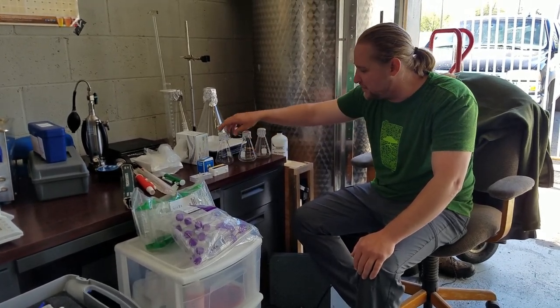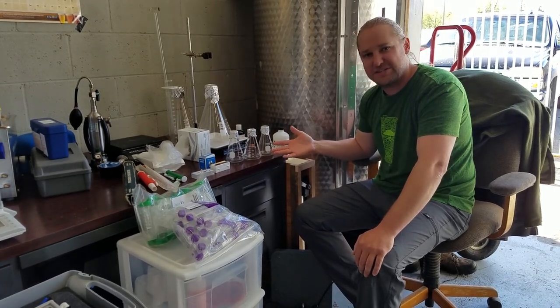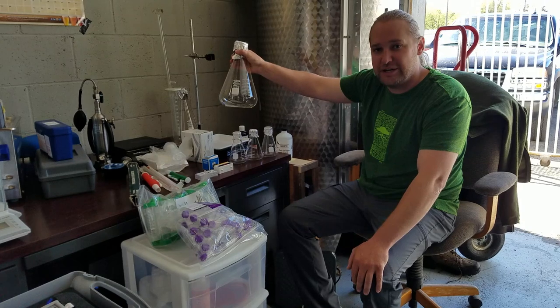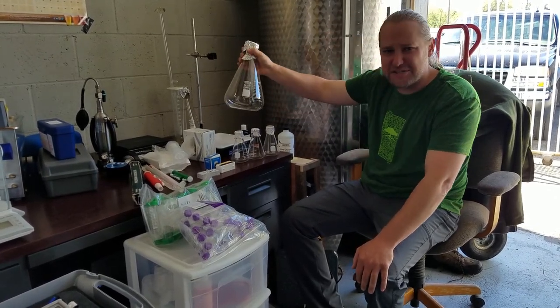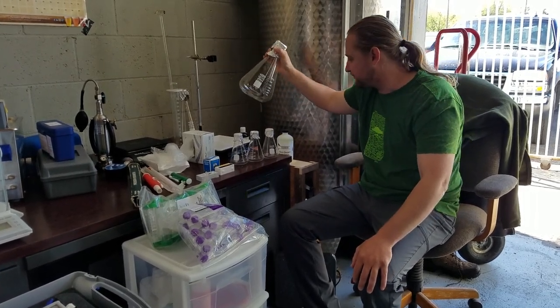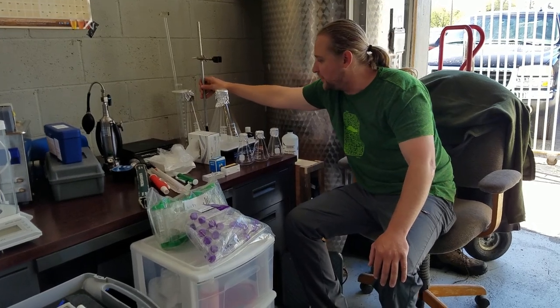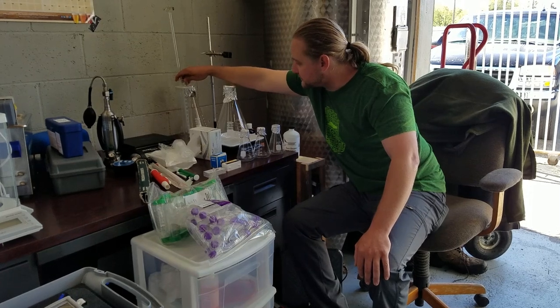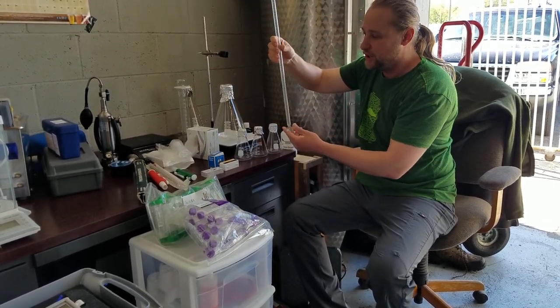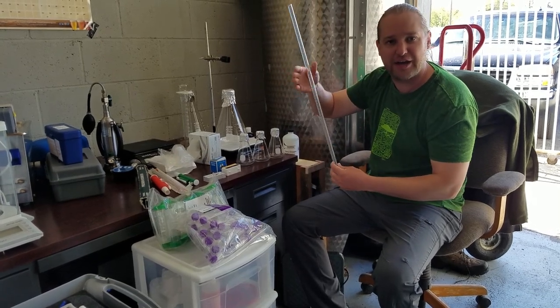Moving on to our glass and beaker setup: we have three 250 milliliter Erlenmeyer flasks, nice for dilutions, rinsing, and collecting samples. We have two 2-liter Erlenmeyer flasks — making yeast starters is really easy in these. We also have our stand and holder for a temperature probe, pH meter, or DO meter. Back here we have a 250 milliliter graduated cylinder and a titration tube, so we can measure the amount of phosphoric acid we need to acidulate our sparge water and get our dosage right using the titration method.